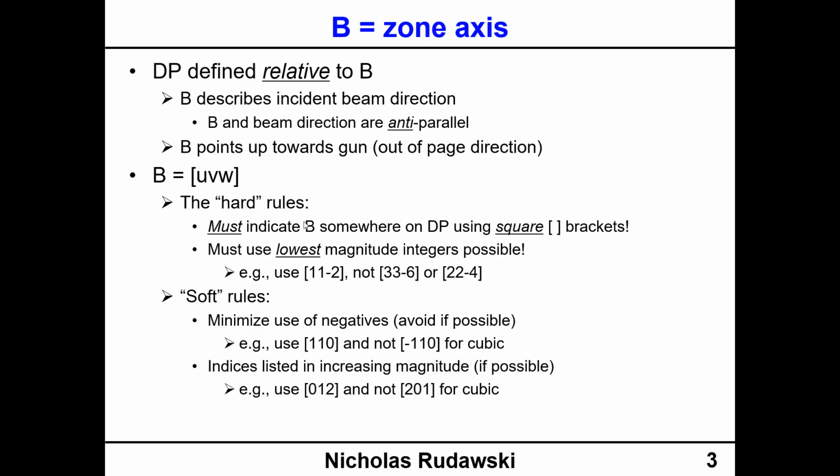So again, what we're going to measure in the pattern is actually a physical distance, okay? So like millimeters or inches or, you know, kilometers, right? Haha, you probably wouldn't be measuring kilometers, but we're going to be measuring a physical distance in the pattern, which is R, okay? So R is going to be the distance that we measure. I think when I do this in PowerPoint, it's going to give us inches, okay? So we'll say this is R in some number of inches, and this is R in some number of inches for G vector 1 and G vector 2, okay? So the ratio of R1 to R2 is equal to the ratio of G1 to G2, okay? All right, so we'll go to the next slide here.